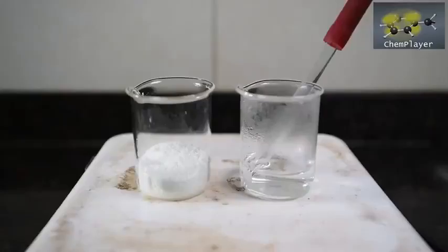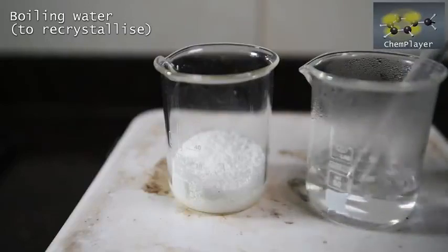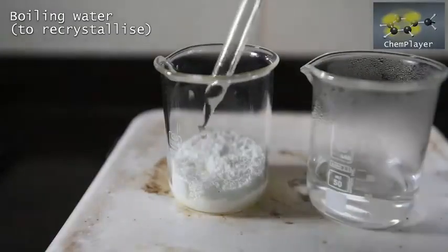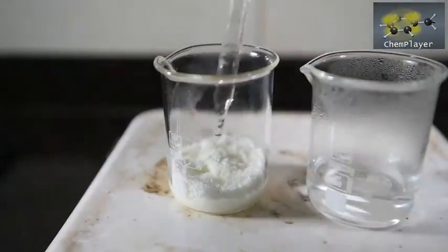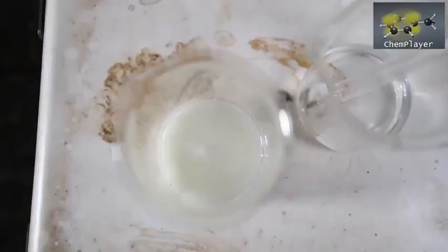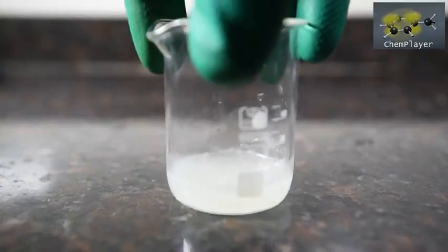But you can recrystallize the product using boiling water. It doesn't take much before you get a nice saturated solution, and this stays supersaturated on cooling for a little while. We recommend chilling this in the freezer, or leaving it out in a crystallizing dish for a while if you want those bigger glass-like crystals that this compound is famous for.